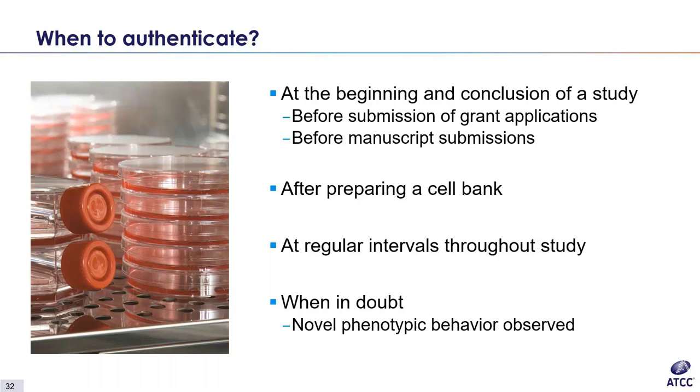Authenticating early and regularly will help identify any cross-contamination or misidentification early on. It is better to confirm you are using the cells that you expect than to find out later that your cells are cross-contaminated or misidentified. I will now hand the discussion back to my colleague Brian, who will close out our presentation.